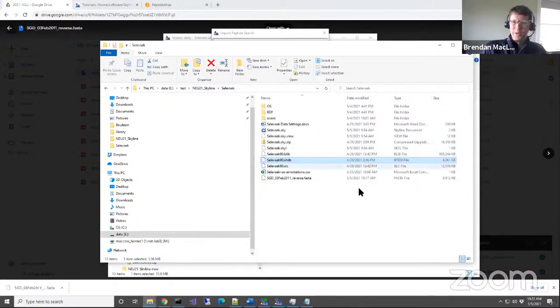So I'm going to relaunch the poll. We'll see. Okay, so some people are just downloading the FASTA file. So we got the poll again.